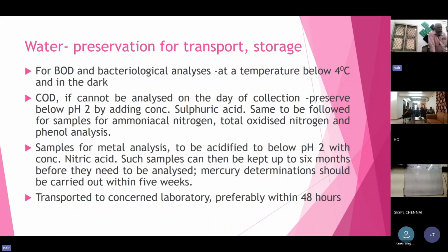In the case of other metals, you can use the atomic absorption spectrometry method. But for mercury determination, it is a cold vapor technique, which is different from atomic absorption. So other methods are done by atomic absorption or another method, but mercury determination is mainly done by the cold vapor technique using a mercury analyzer.